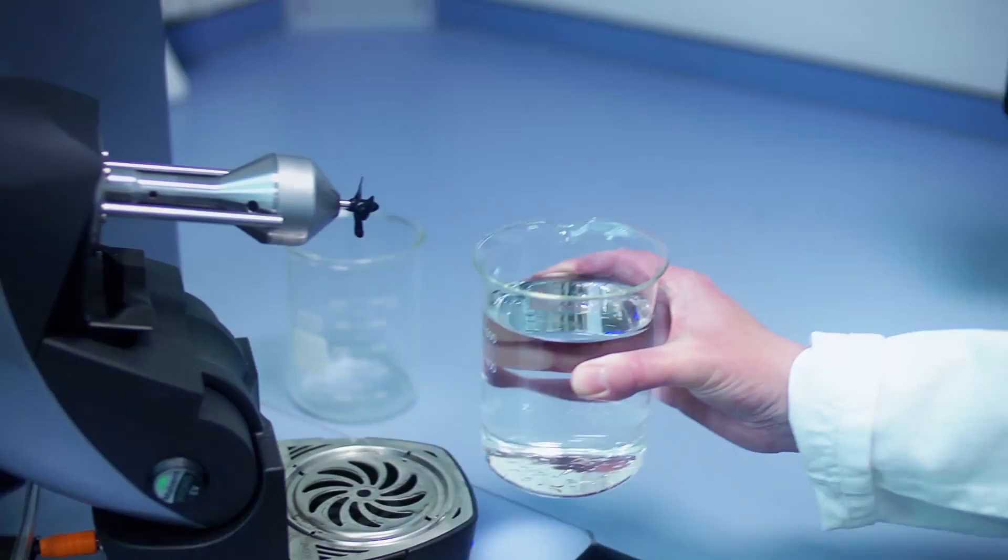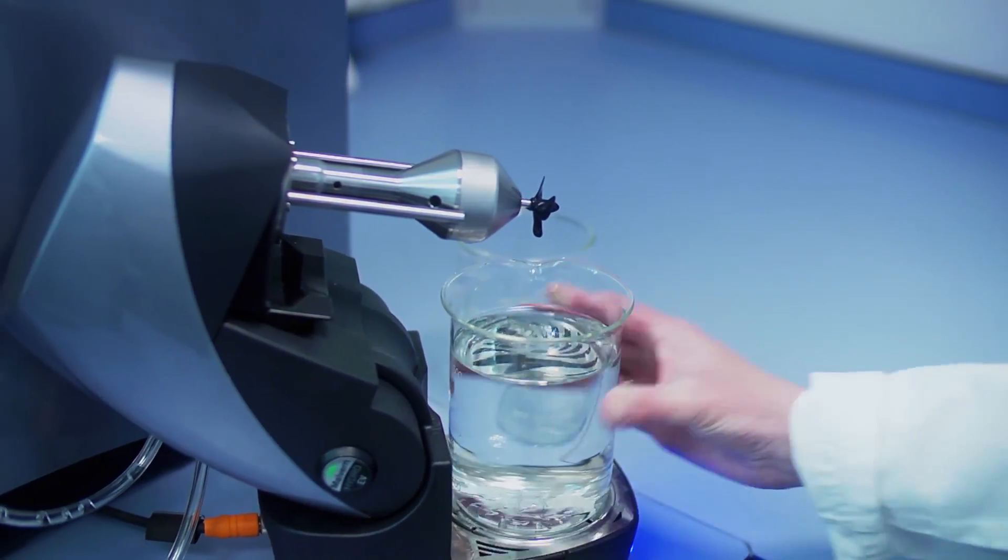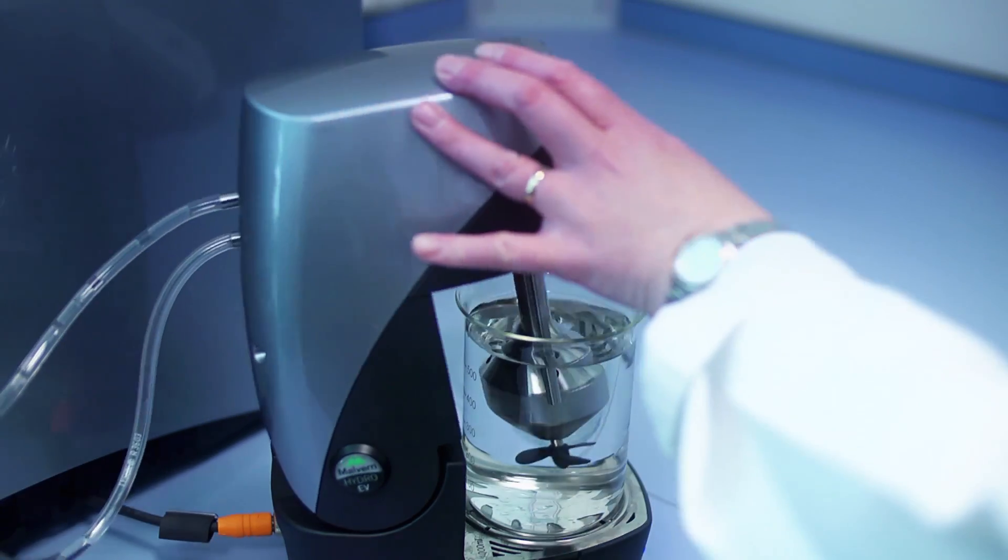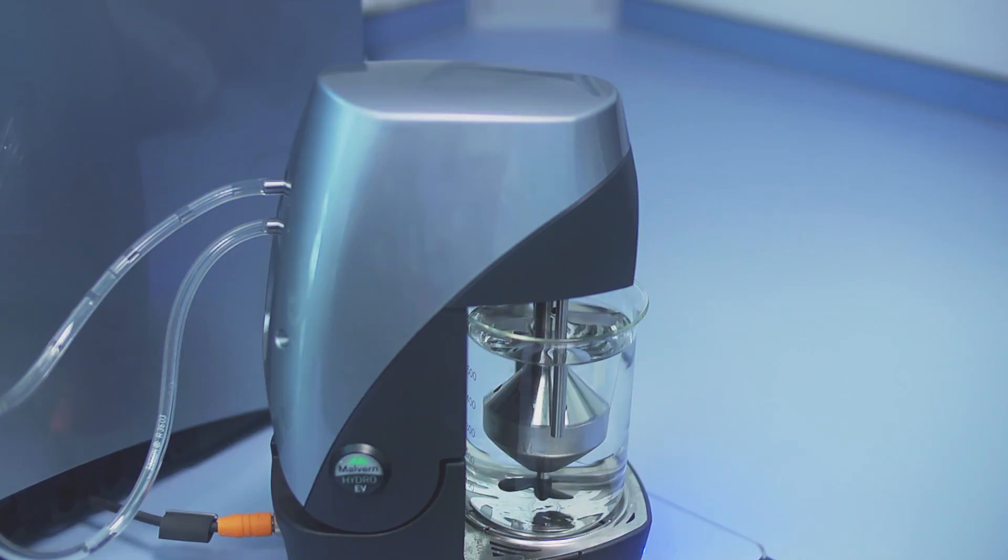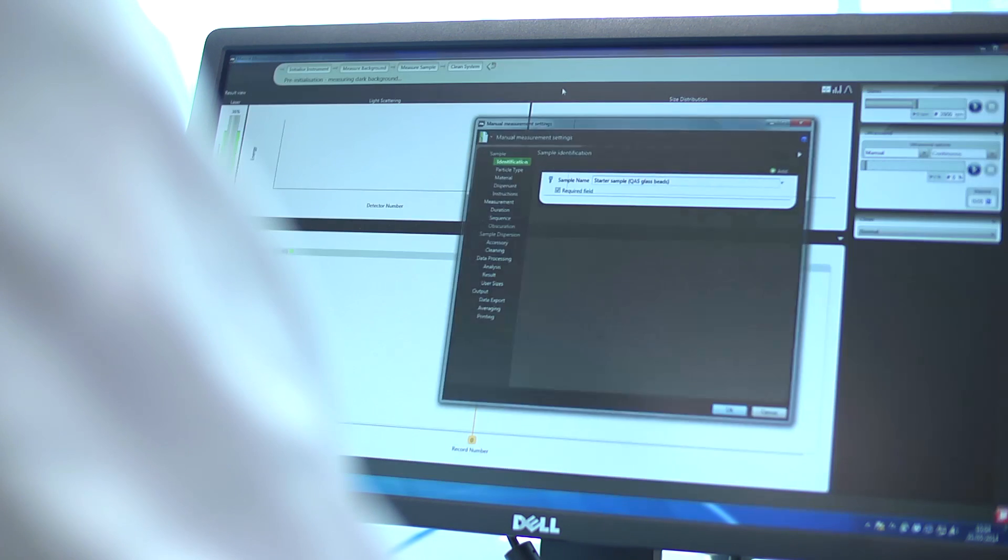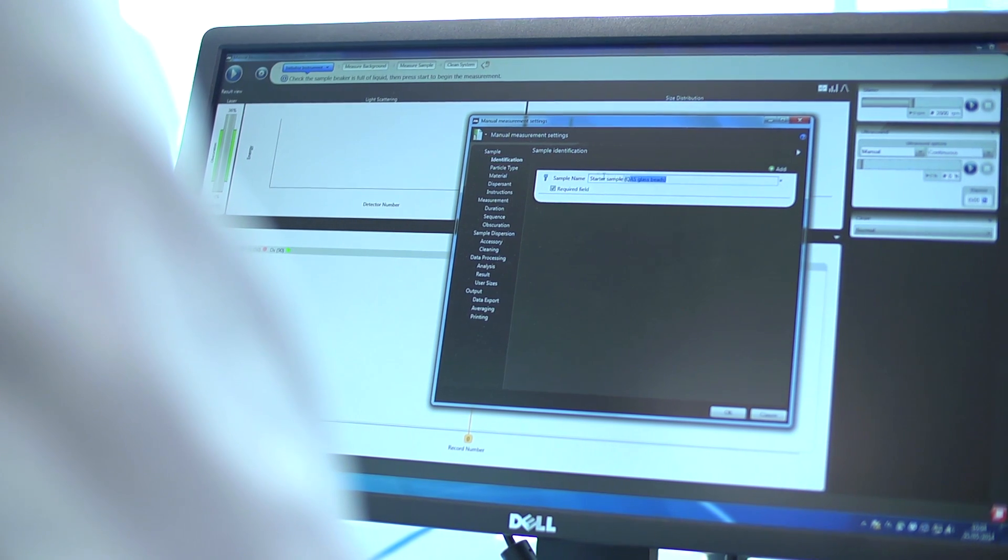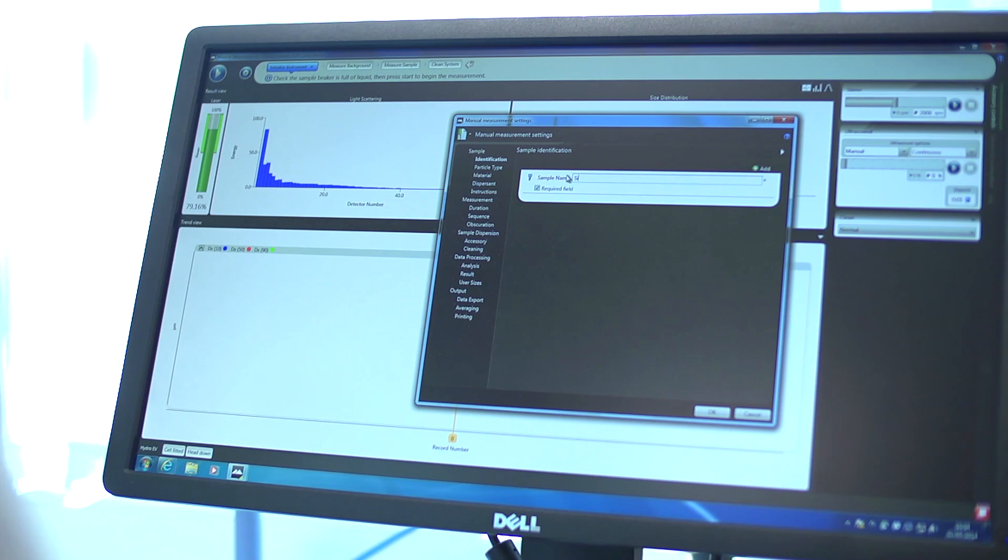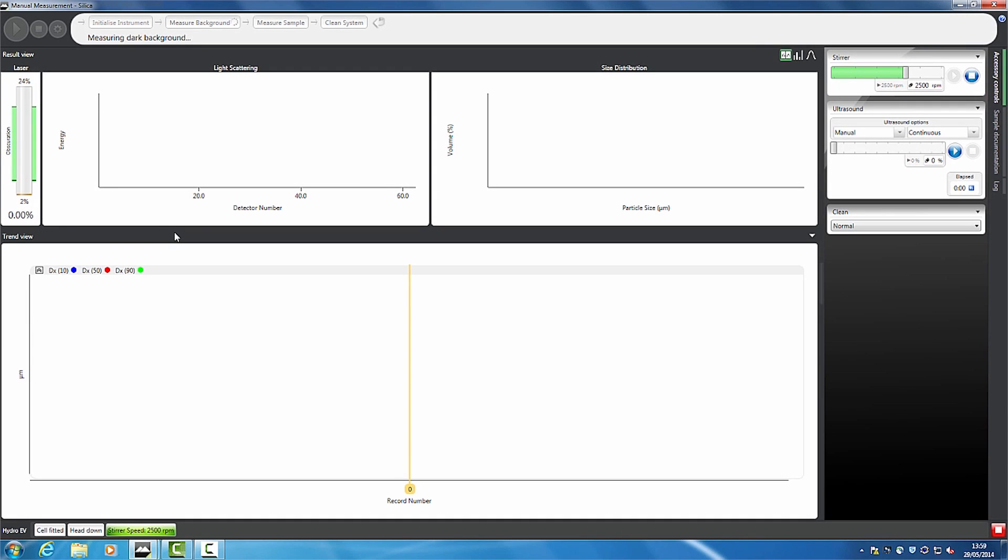The Master Sizer 3000 system and its software has been designed to make method development easier. During method development, the Master Sizer 3000 measurement manager provides a view of everything you need to understand and optimize the measurement process. This includes controls for the dispersion unit, live reporting of the data being collected by the system, trending of the results, and a simple view of where you are in the measurement process.